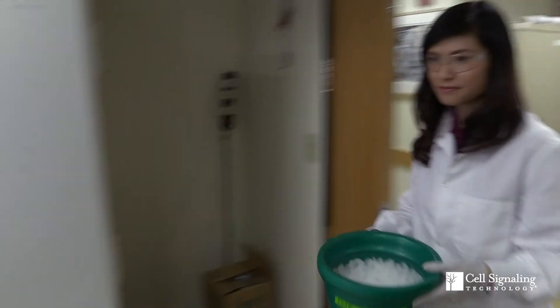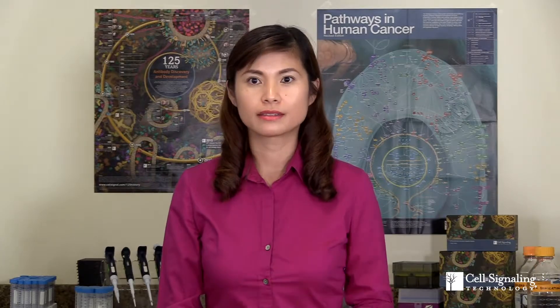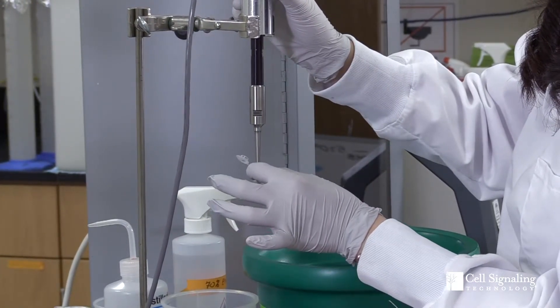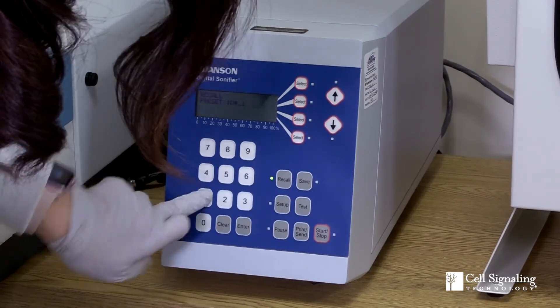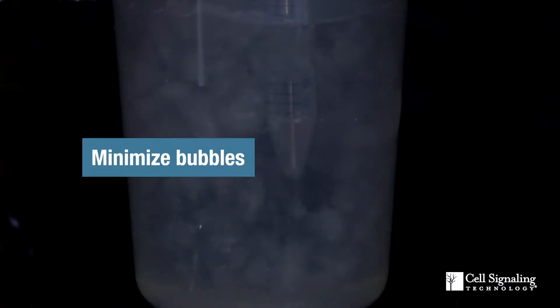Both protocols have some general tips. First, always keep samples on ice during and between sonication cycles to avoid warming up. Second, insert the tip of the sonicator probe to the bottom of the tube and adjust the sonicator settings, like amplitude, to avoid bubbles during sonication. Otherwise, your target protein could get denatured and you can lose your ChIP signal.